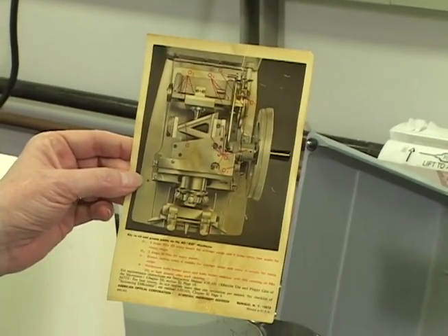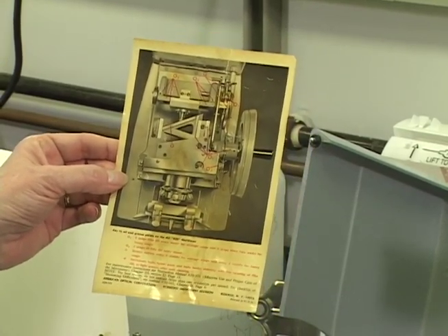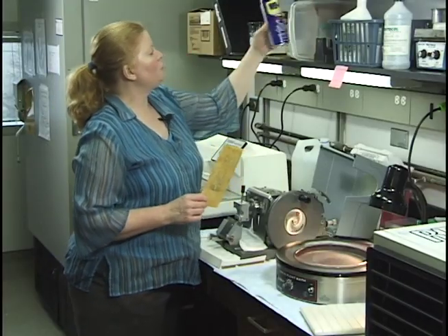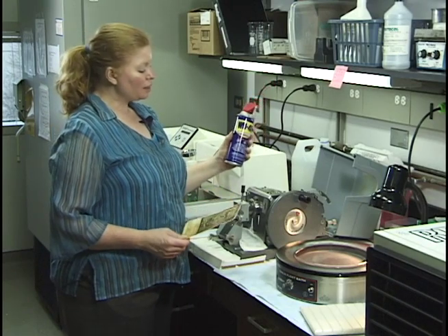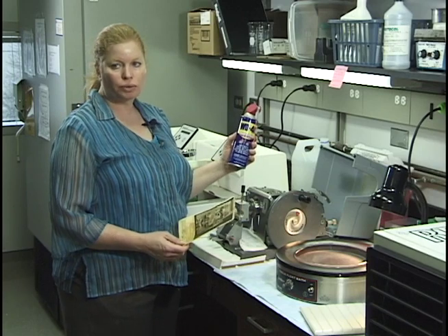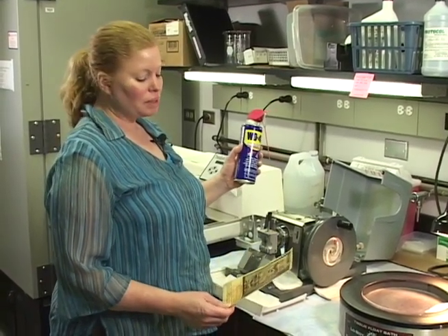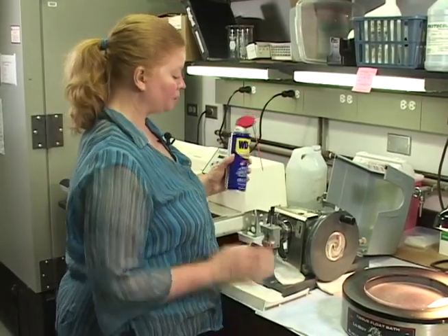For me, I'm not using oil because this microtome, when it came to us, had very old yellow grease in it. So I'm choosing to use WD-40. There are other brands, but this is the one I use. The reason I tend to use this is that over time I'm trying to get some of that old residual grease and other stuff off, and this helps clean that. So I lubricate this with this thing.